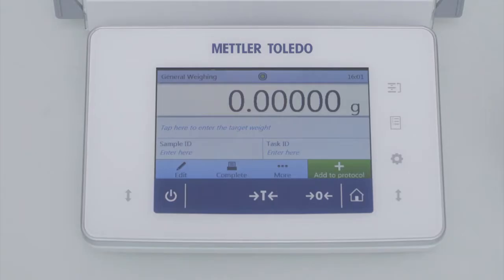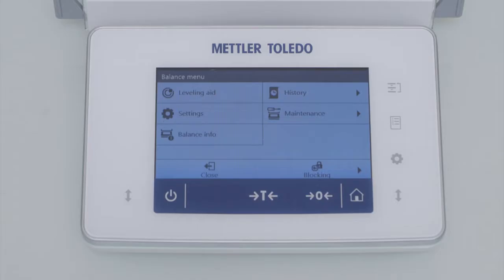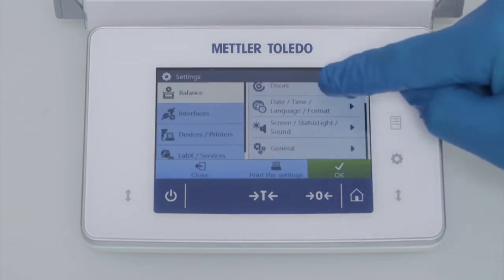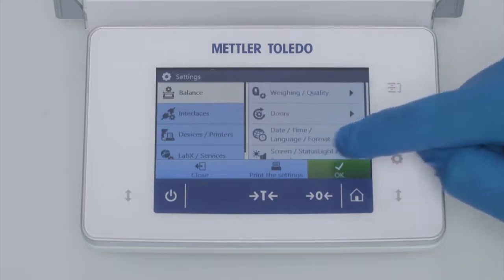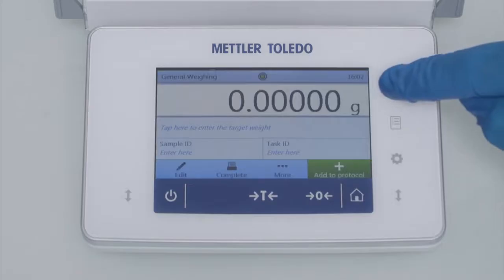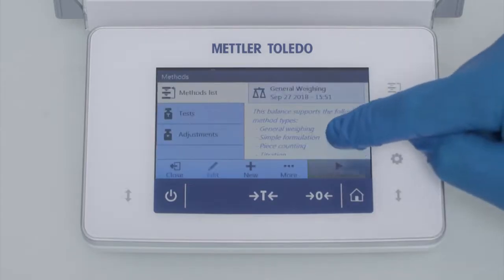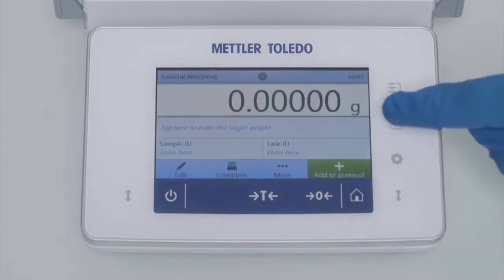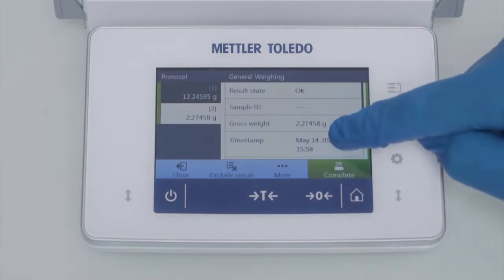The user interface is logically structured. You find the settings and configuration section on the left side by pushing this button here. All methods such as formulation and its specific settings can be accessed by pushing here. Finally the results and all related information are summarized in the result notepad on the right.